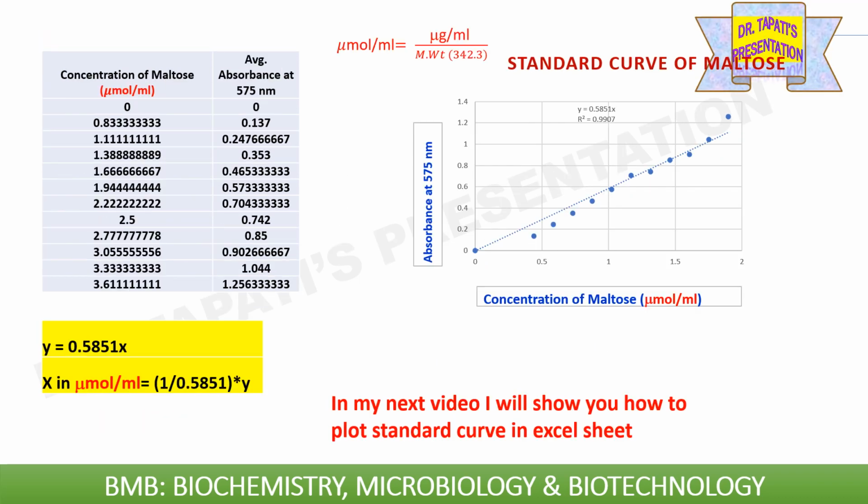So this is the standard curve of maltose following the DNS method, and here in the x-axis we are plotting concentration of maltose, and in the y-axis absorbance at 575 nanometer, average absorbance, as we are taking triplicate data. From this standard curve we can calculate maltose concentration in micromole per ml of an unknown sample.